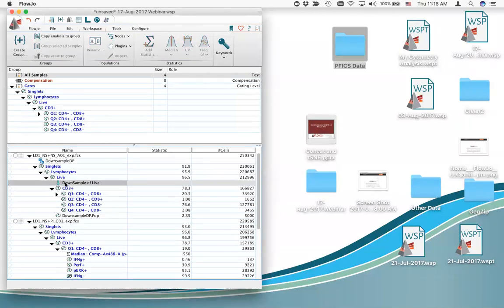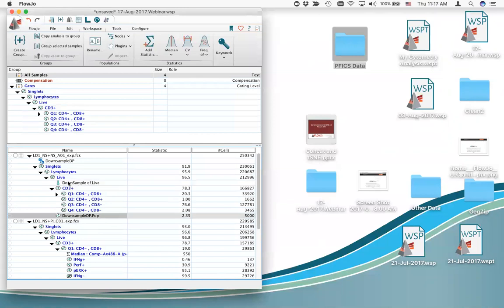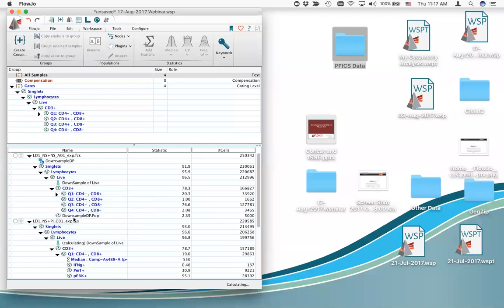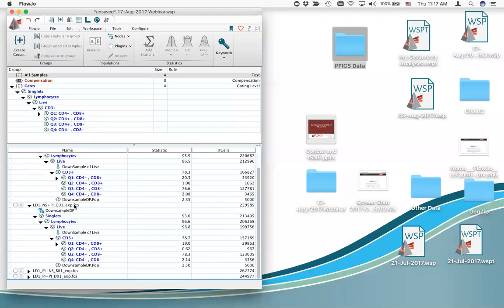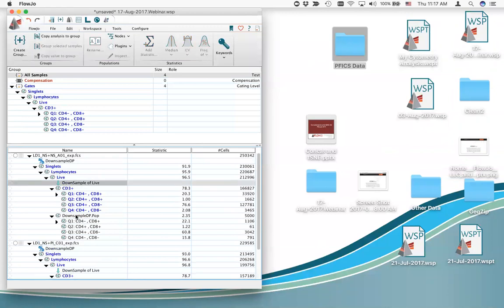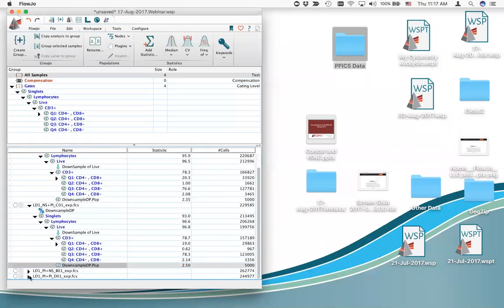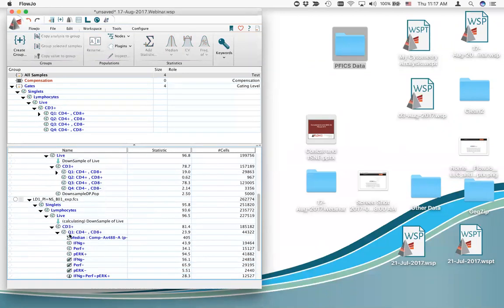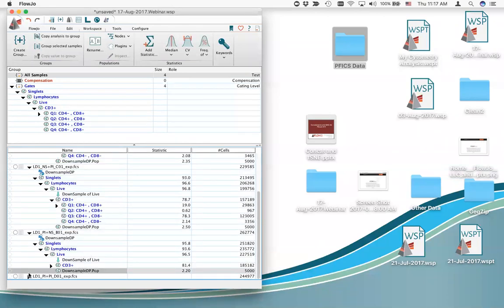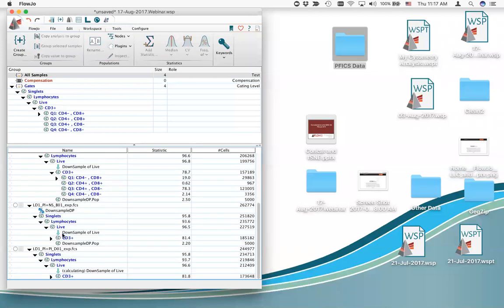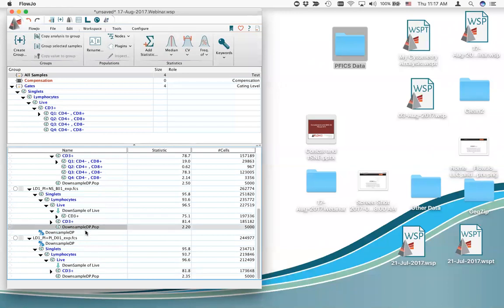I click OK and get the downsample population. Every time you run a plugin you get a node showing what you did — this is 'downsample of live'. This is an operation I can drag and drop to a gated population elsewhere. I'll grab the downsample of live and drag it to the next live node. I'll do this two more times — drag the downsample of live to each live node — so now I've got four gated populations all named the same thing, all downstream of the live sample.